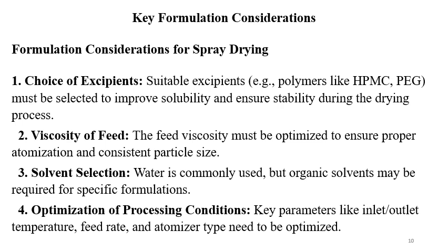Polymers are selected critically as these improve the solubility and also have impact onto the stability. Whenever you are working onto the amorphous solid dispersions, that time conversion to the amorphous form and retaining that amorphous form is a very important consideration.